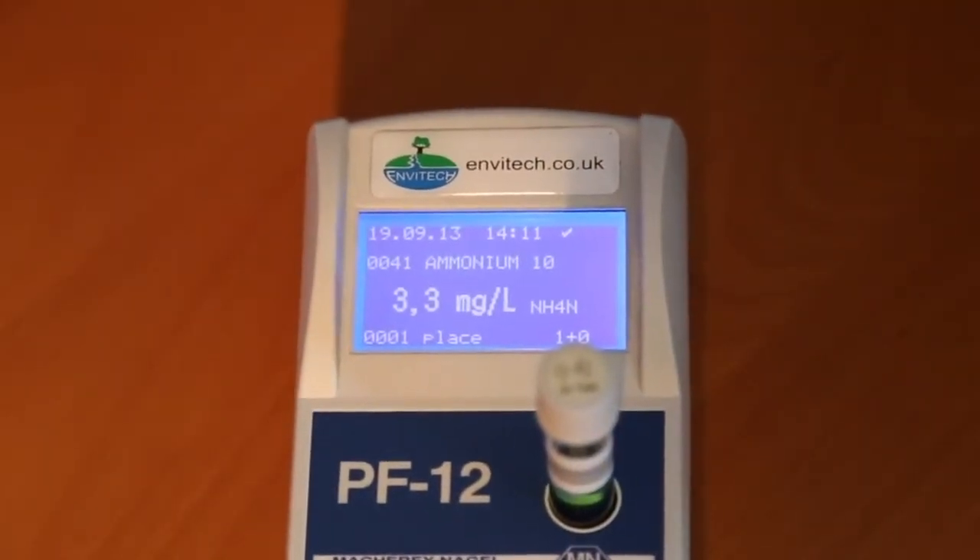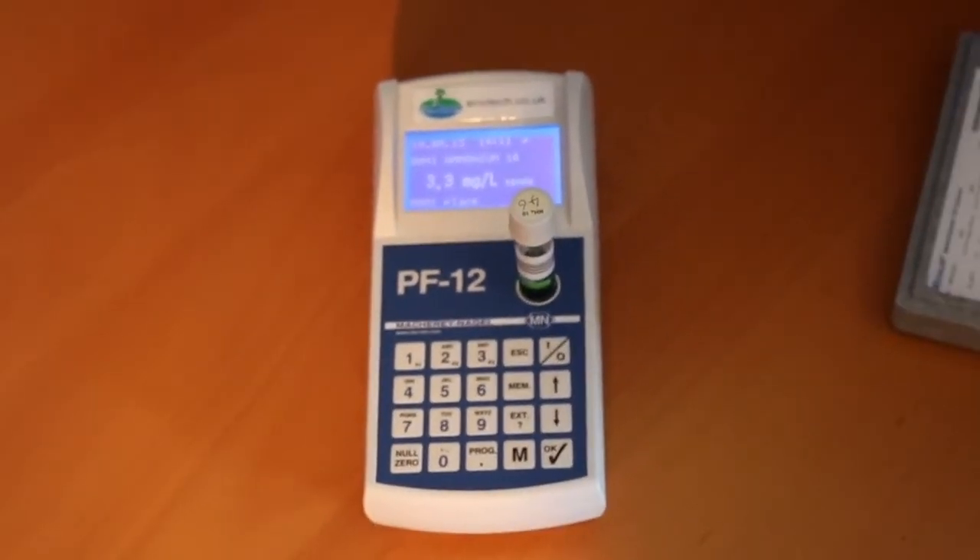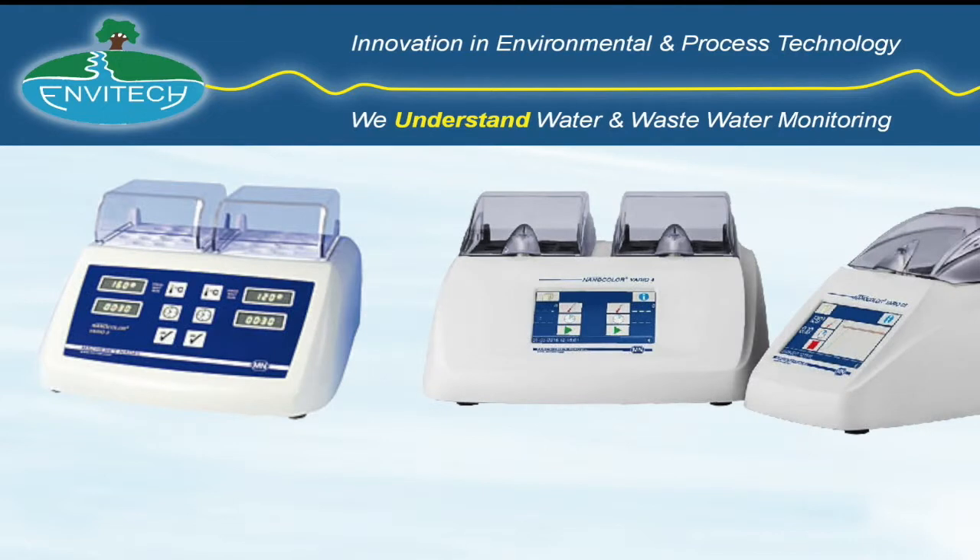Some tests such as COD or total phosphorus require the sample to be digested at high temperature. This is achieved by simply placing the cuvette into one of the available Macherey-Nagel heating blocks for the required time.